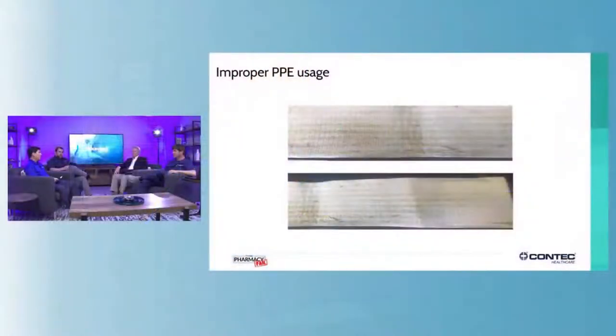Absolutely. The other PPE that we see throughout hospitals all the time is spunbound polypropylene shoe covers. They're the blue shoe covers with the racing stripes on the bottom that can particulate as well, but those shoe covers are really thin, so you have to consider what's on your shoe, right? If you have a dedicated shoe, then maybe those are appropriate, but if you don't, you have the potential of something coming off that shoe through that shoe cover as well.